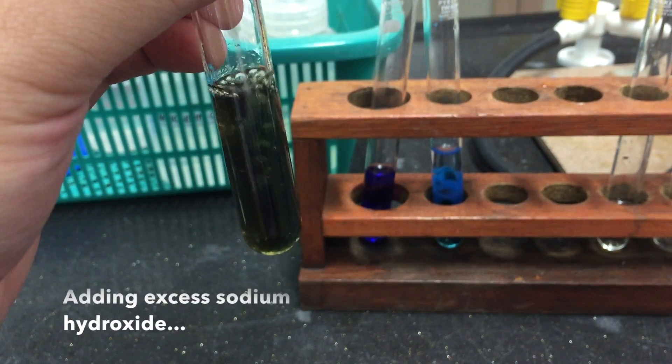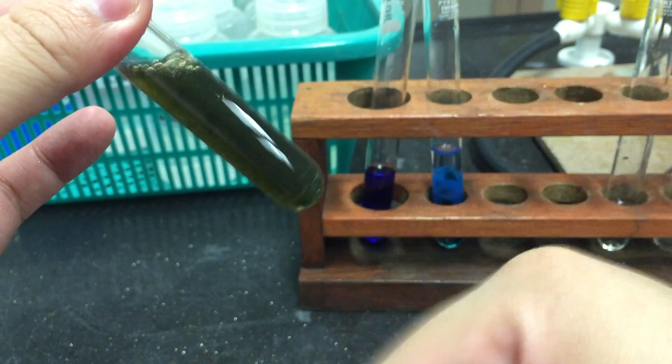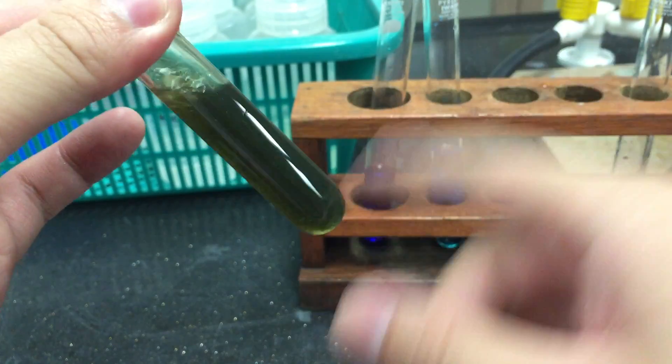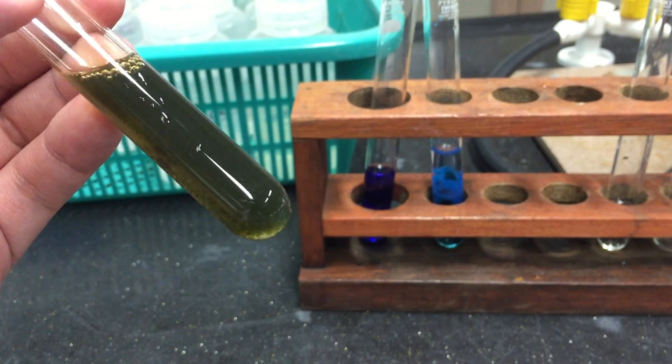Proceed to add an excess of sodium hydroxide solution. You will notice that the dirty green precipitate remains insoluble in excess sodium hydroxide.